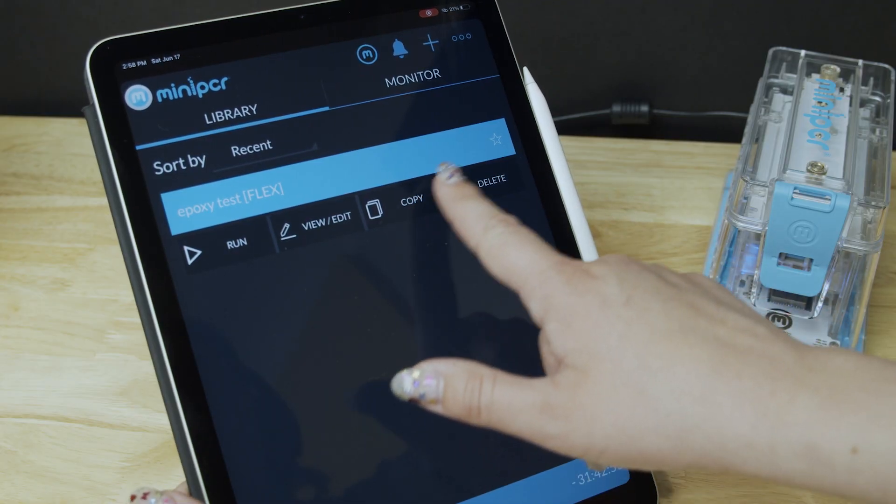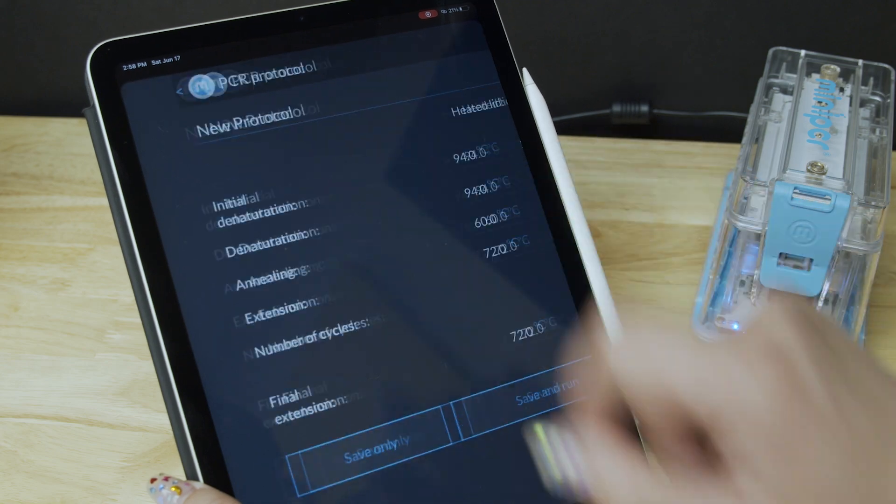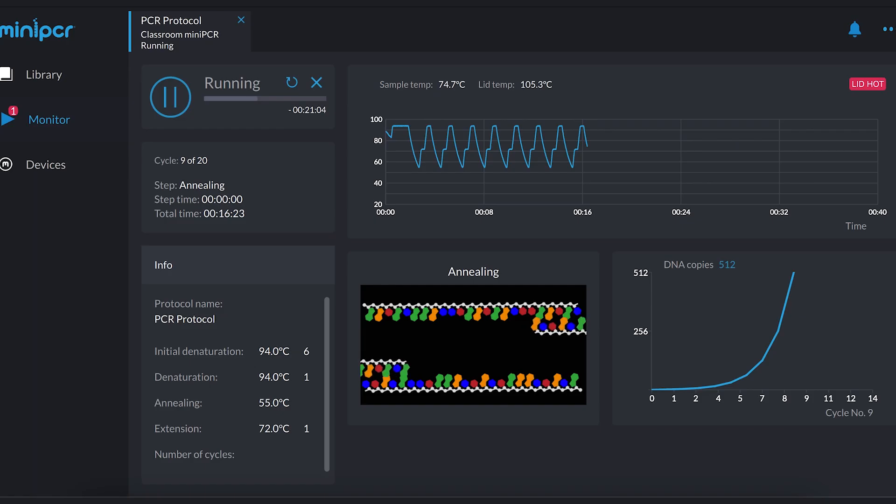Programming is simple and intuitive through the Mini-PCR app. Both devices can run fully customizable PCR, heat block, and temperature ramp protocols, as well as flex programming, allowing you virtually unlimited options, including touchdown PCR.